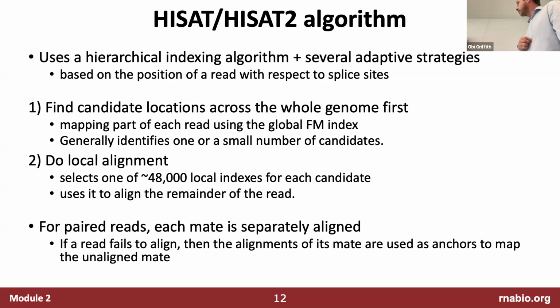So it's going to do the paired reads separately, but if it really has trouble with a read, it will attempt to use the mate to give it a clue of where to start looking.